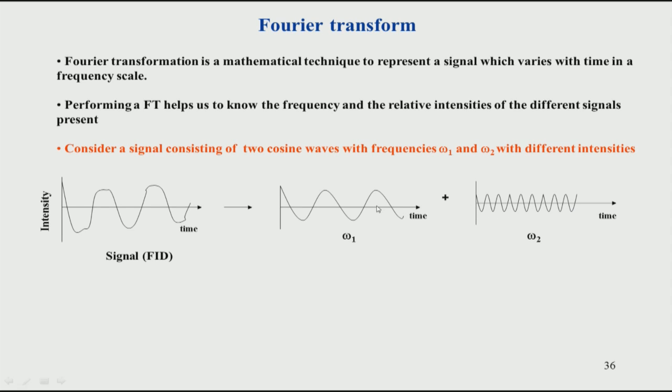You can see the frequencies are not the same now because they are two different atoms in the same molecule, and therefore they have two different frequencies. These two different frequencies also have different amplitudes. You see the height is also not the same here and here. That is because this particular frequency may come from 3 hydrogen atoms, so it is 3 times the signal of this one, which may come from 1 hydrogen atom. So, you see that is the difference in NMR.